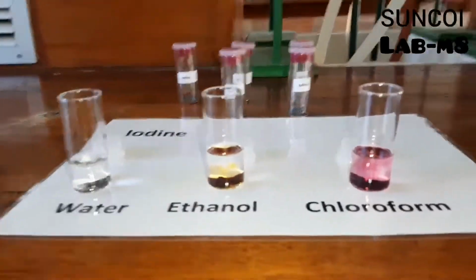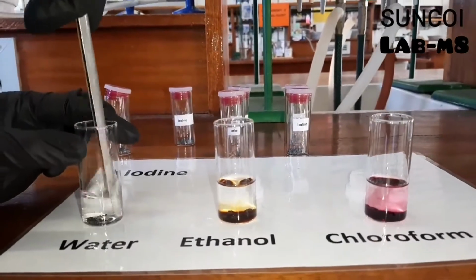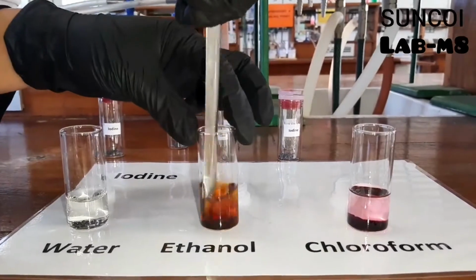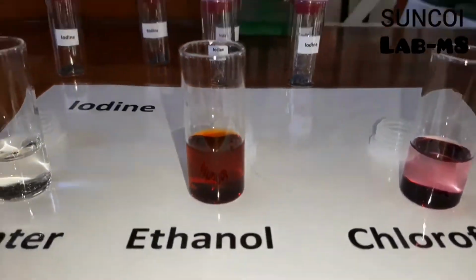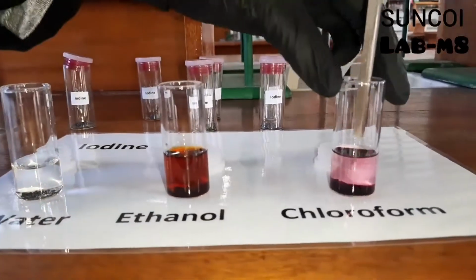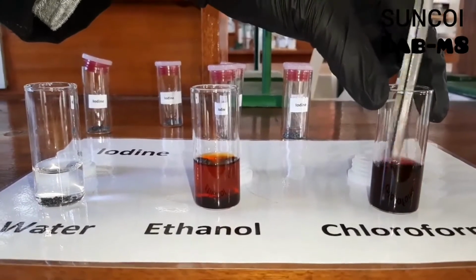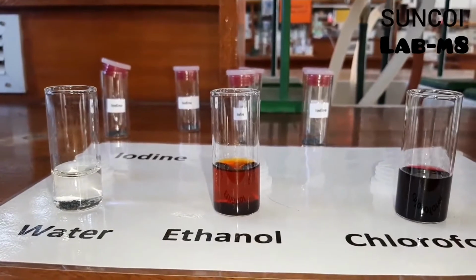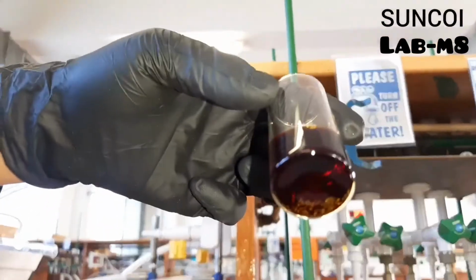Watch carefully what happens. Does it dissolve? Does it not dissolve? You need to explain why, for instance, the iodine is not dissolving in the water. This has to do with like dissolves like. So if the one is polar and the one is non-polar, it won't dissolve. If both are polar or both are non-polar, it will dissolve. So look carefully. There's still some undissolved substance in the ethanol.